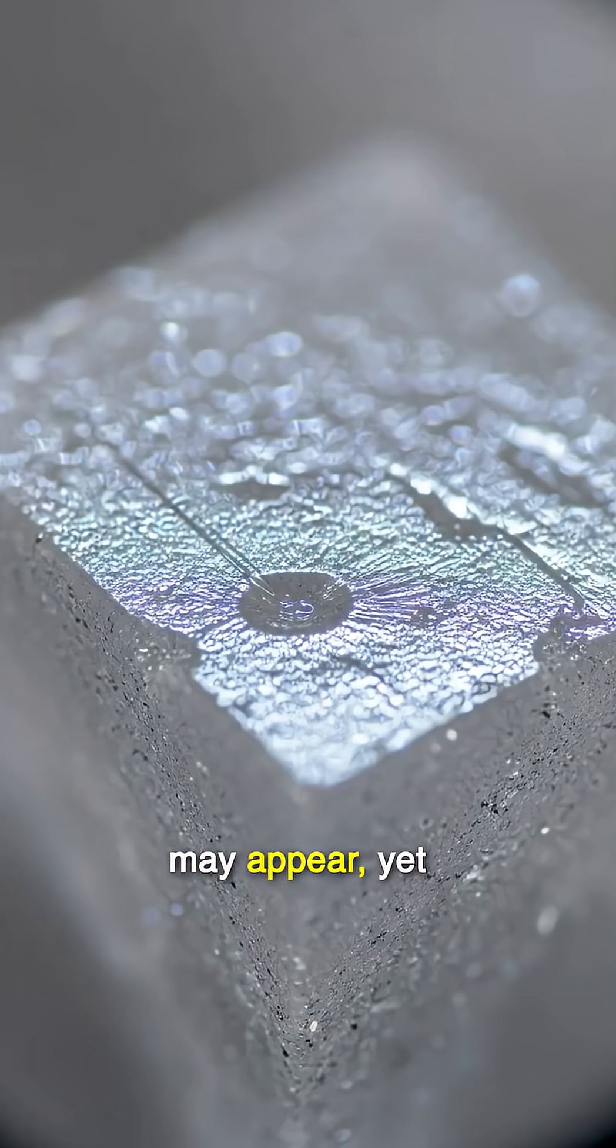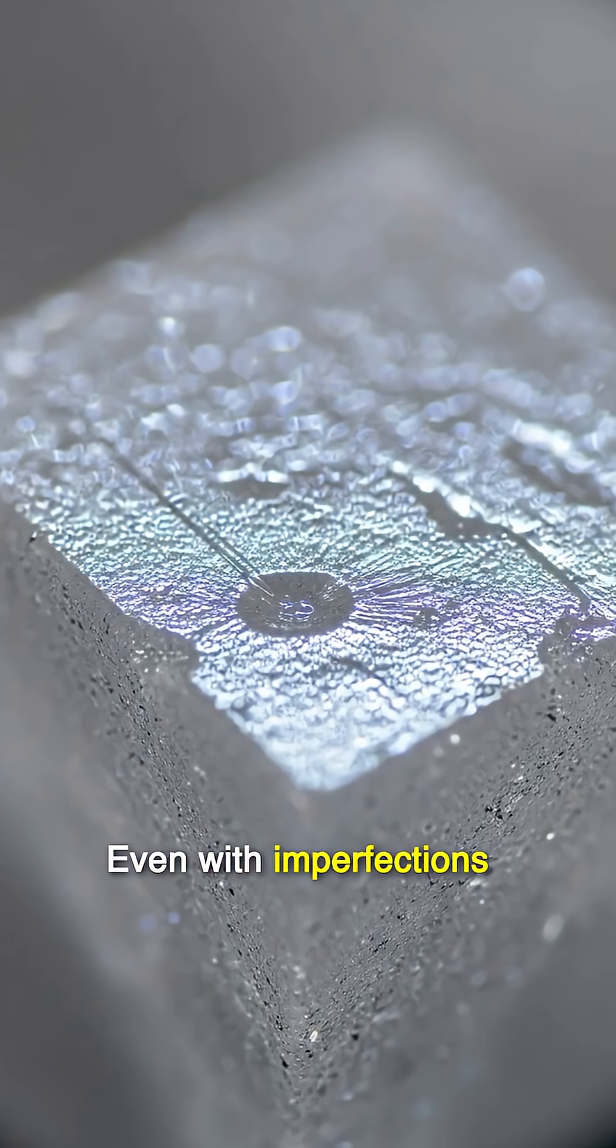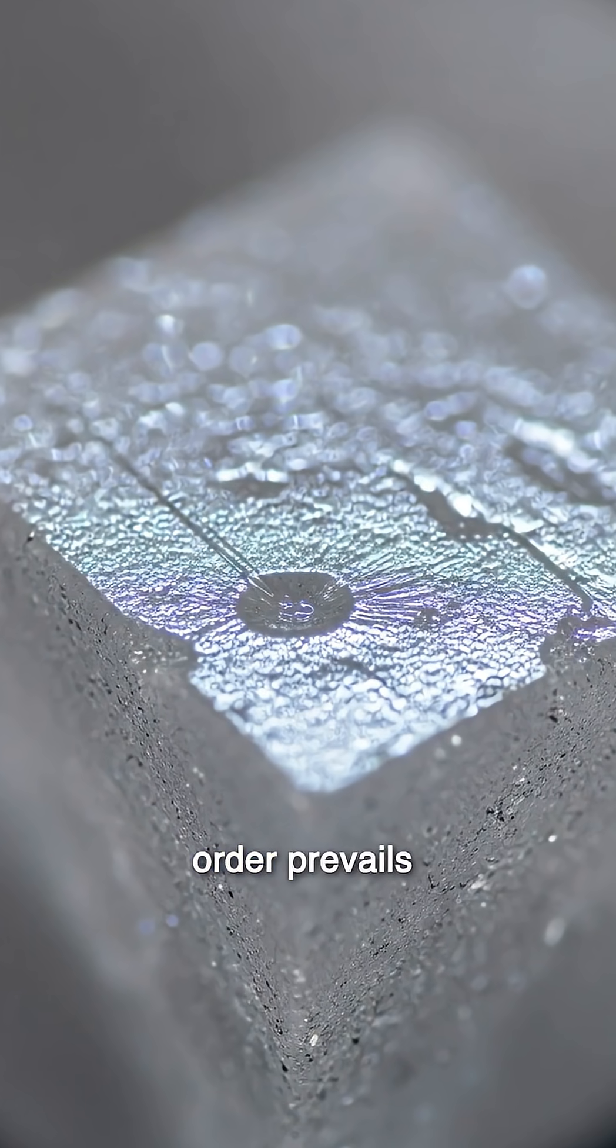Small flaws may appear, yet symmetry is never lost, a matter of arrangement. Even with imperfections, the crystal's order prevails.